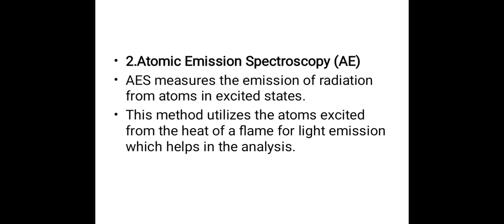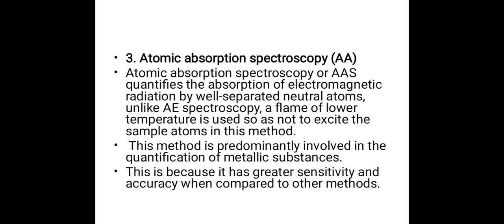Atomic emission spectroscopy. AES, or atomic emission spectroscopy, measures the emission of radiation from atoms in excited states. This method utilizes the atoms excited by the heat of a flame for light emission, which helps in the analysis.